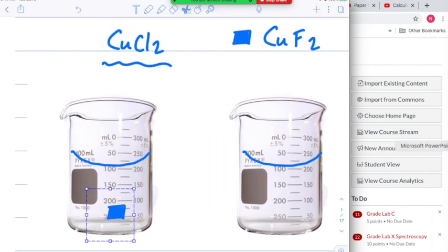Now imagine you're giving it enough time to dissolve. You're going to stir it up with your glass stir rod. What will happen is the solid will dissolve, meaning we no longer see this piece of crystal here. And instead, for copper, it does turn the solution blue. I apologize, I'm not great at coloring in between the lines, but I will give it my best here.